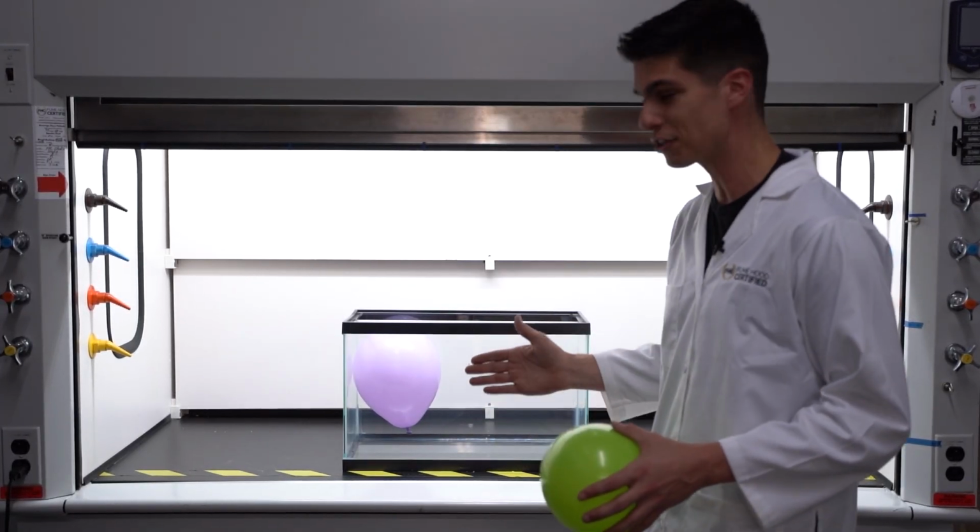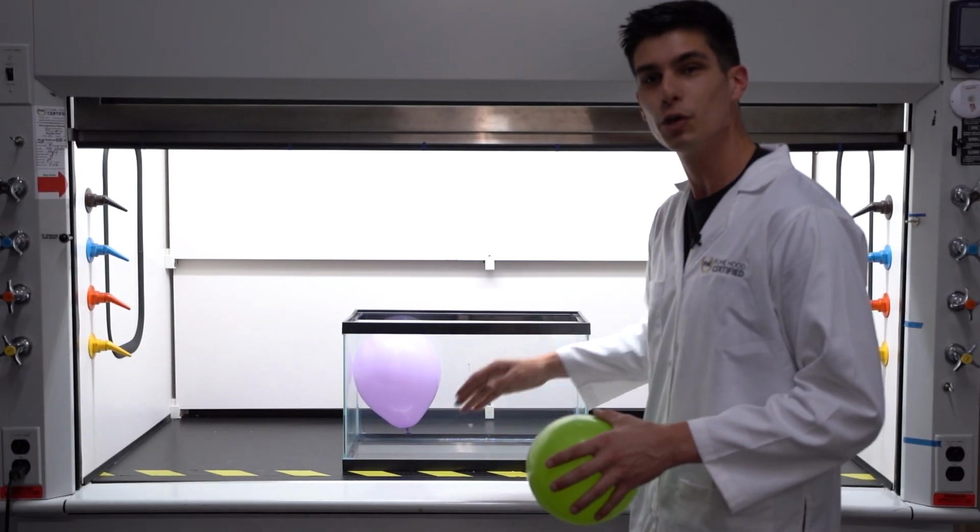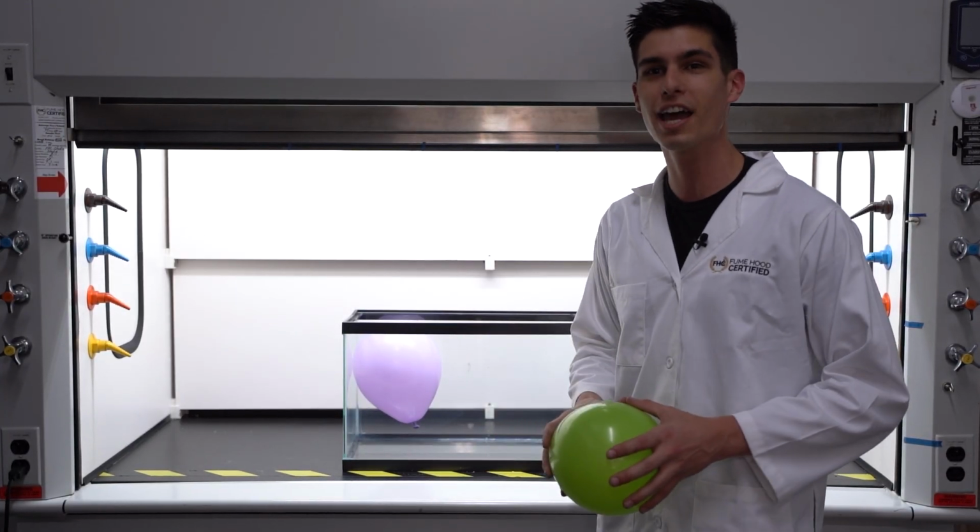You don't want to make sure that just the bottom of your hood is safe. You want to make sure that your entire hood is actually containing and is safe.